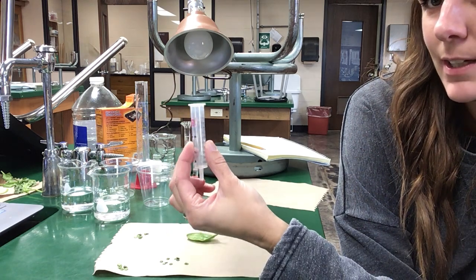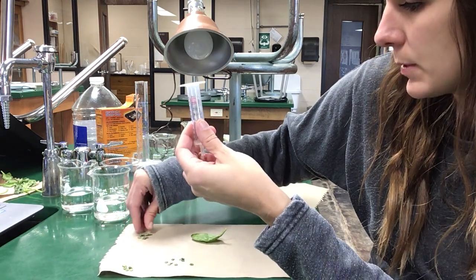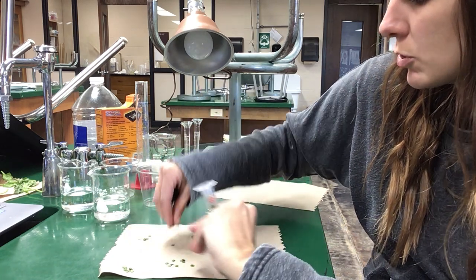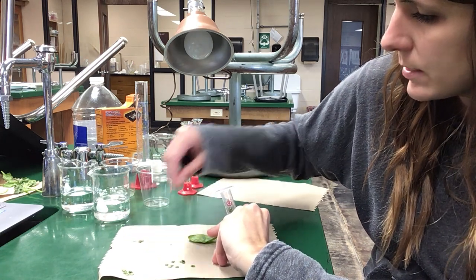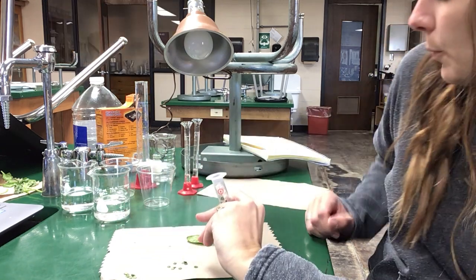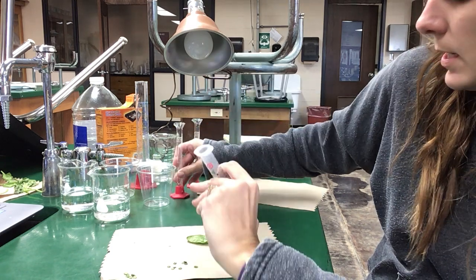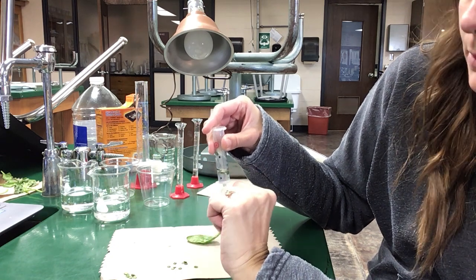The way we're going to do that is creating a vacuum in a syringe. The first thing you do is take your 10 leaf discs and put them into the syringe. When I put them into the syringe, I'm also going to put in that bicarbonate solution, which also has soap in it, which you should have read. The reason soap is added is because the leaf's surface itself is hydrophobic. So this 3 milliliter solution that we're adding has soap that counteracts that hydrophobic surface and allows the bicarbonate solution to go in.